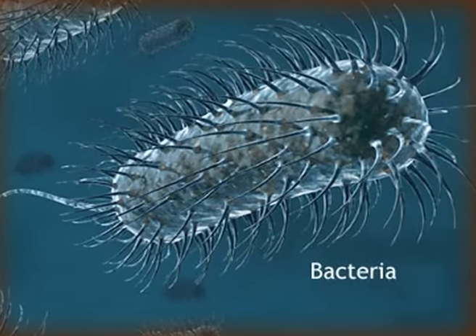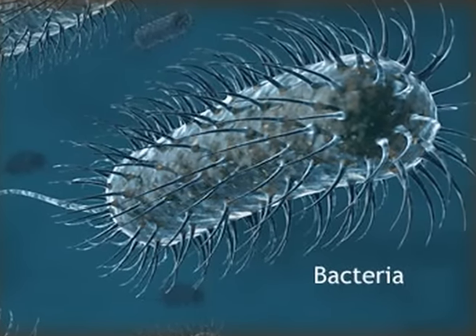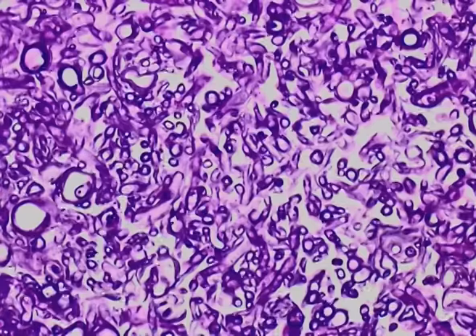In this way, we can select the yeast from bacteria, and if we want to select bacteria from yeast, we can grow them in a media containing neutral pH. This will allow only the bacterial cells to proliferate and grow while eliminating the yeast and fungal cells. The most important group of another kind of media which falls under this third system of classification is differential medium.